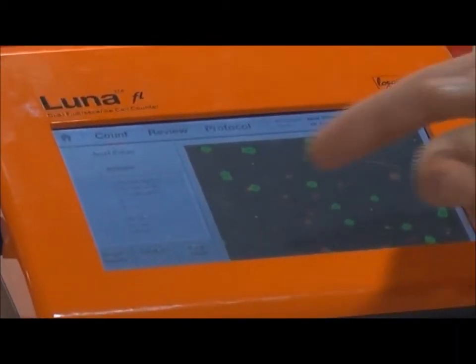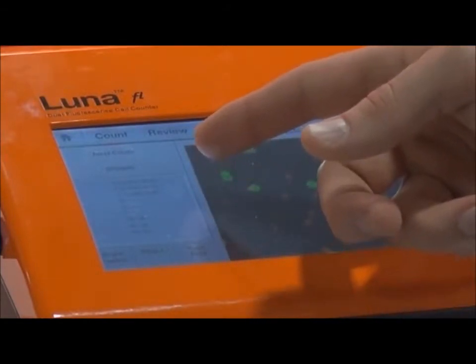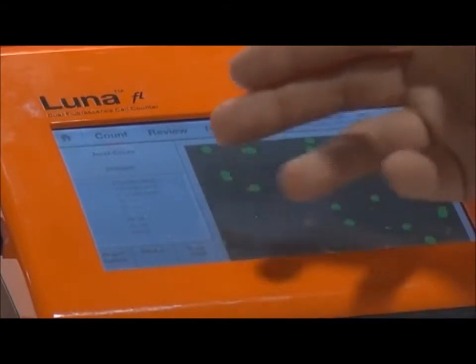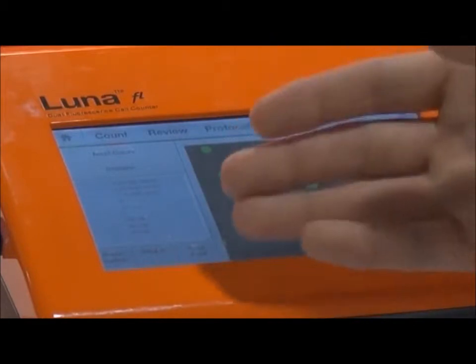After performing the count, the Luna displays all of the information on the left side of the screen, including the total concentration, the concentration of living and dead cells, the viability, the average cell size, as well as the total number of cells counted in the sample.